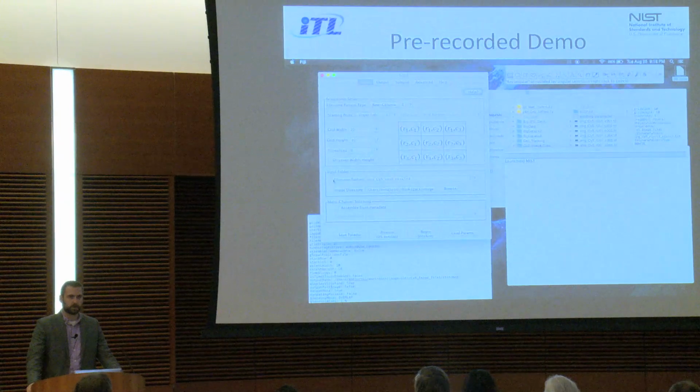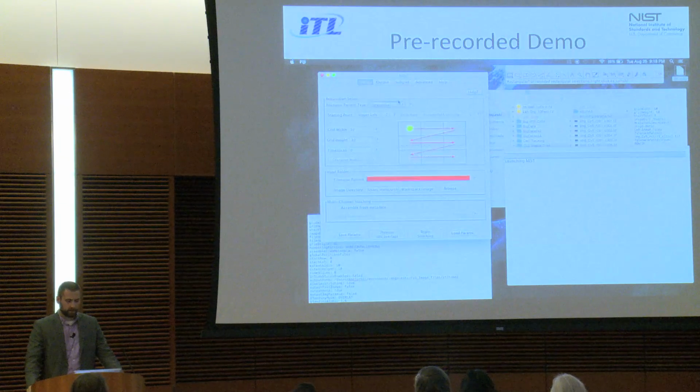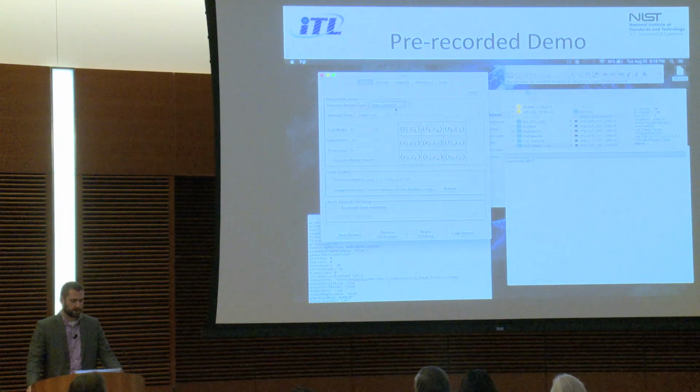The input folder controls where the files are stored on the disk, and multi-channel stitching below that is assembling new images with old translations. For the test data set, you've got two types of grids, sequential and row column. Micromanager has the row column format. Then you've got to set up your grid origin: upper left, upper right, lower left, lower right. The graphic updates as you go along.